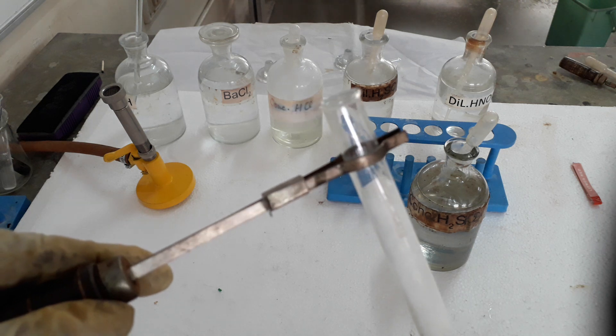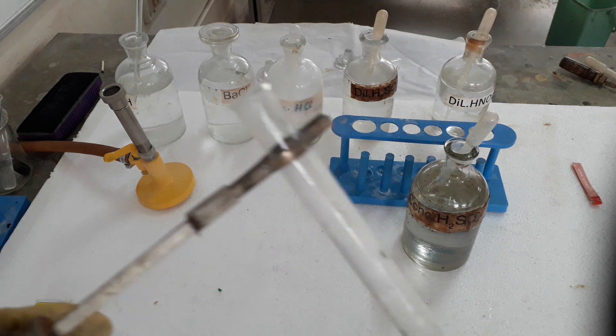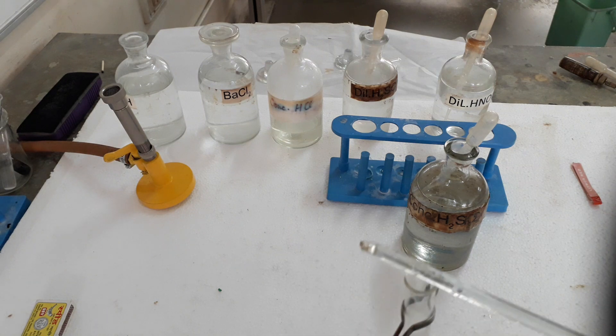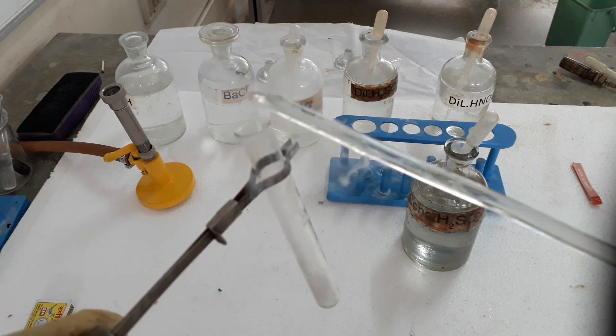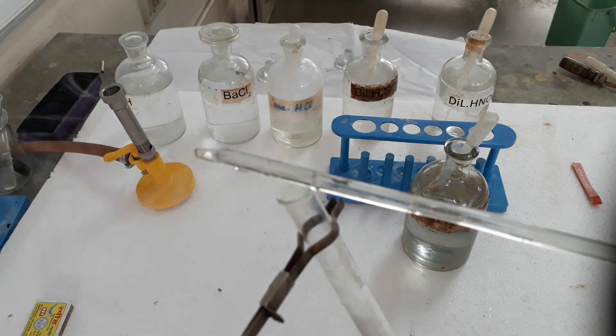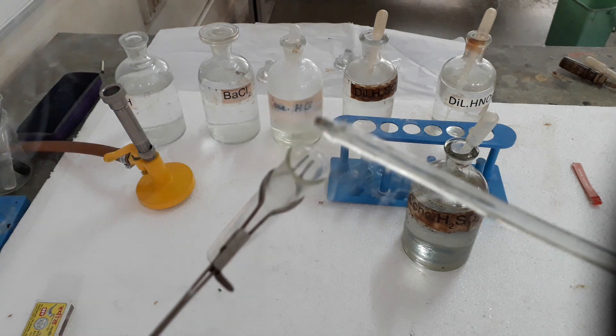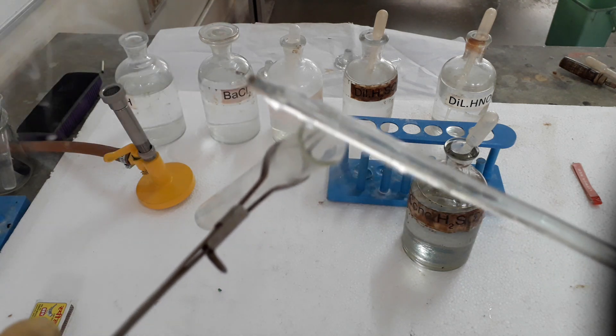You can see some fumes started coming out. This gas is HCl which fumes in moist air; it is highly soluble in water. Now a rod dipped in ammonium hydroxide is brought near it — it will give us dense white fumes of ammonium chloride. This is the confirmatory test of HCl, hydrogen chloride gas.